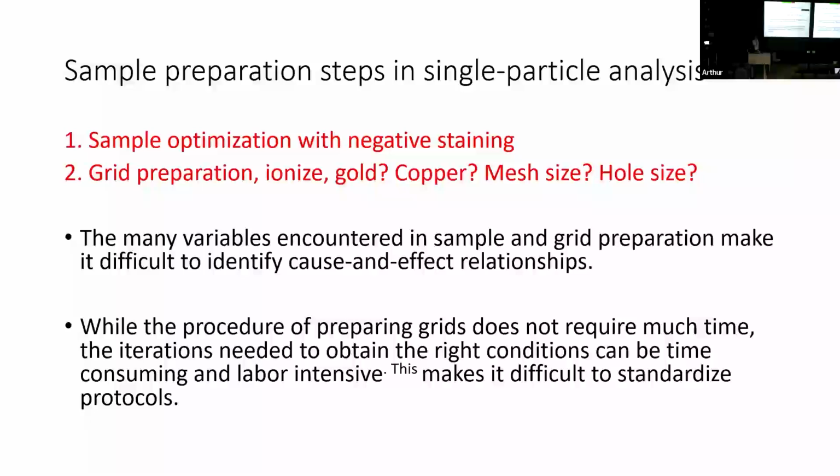So while preparing a grid itself does not take a lot of time, the number of iterations that you might have to go through to get the perfect sample does take a lot of time. And that's why it's difficult to standardize these protocols. Unfortunately, we're in the stage of cryo-EM's development as a methodology where we're all still learning. Everybody's going to have to make their own protocols for their own proteins.